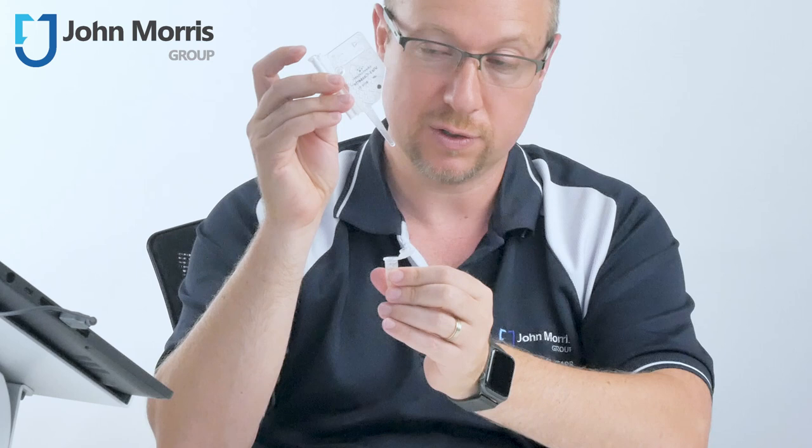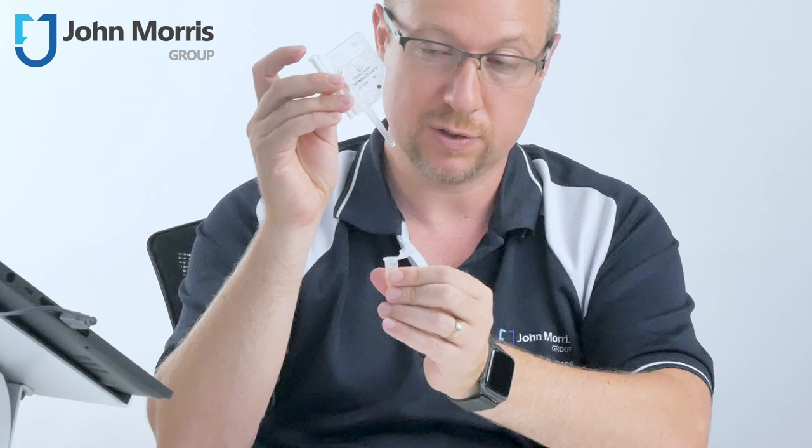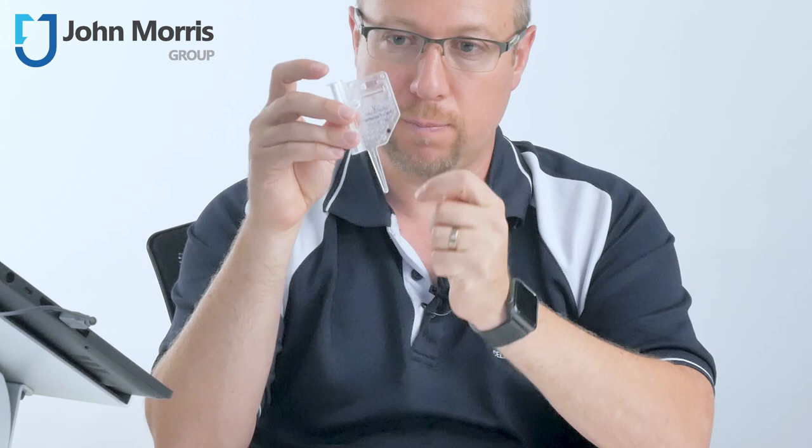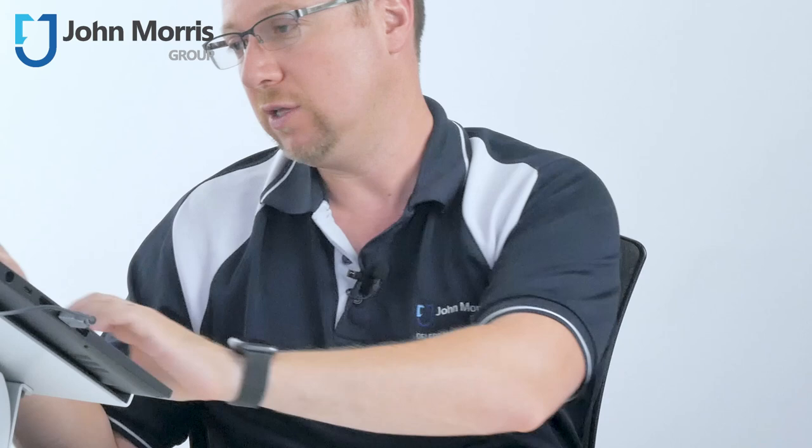And what you can't see because this liquid is clear is that we've now actually brought or drawn the liquid up into the micro channels. So now we're going to introduce it into the instrument and away we go.